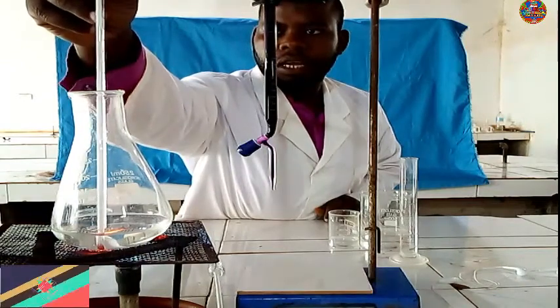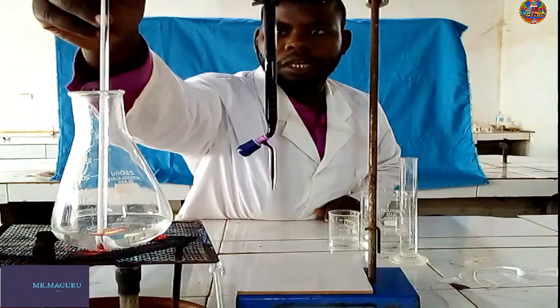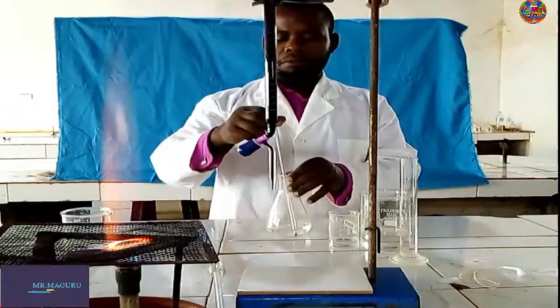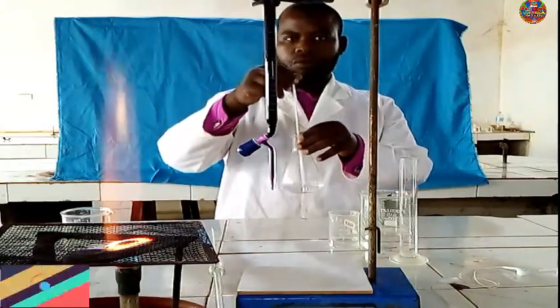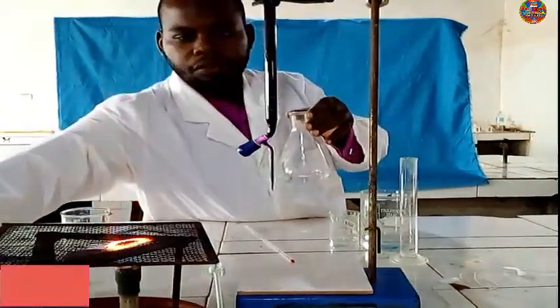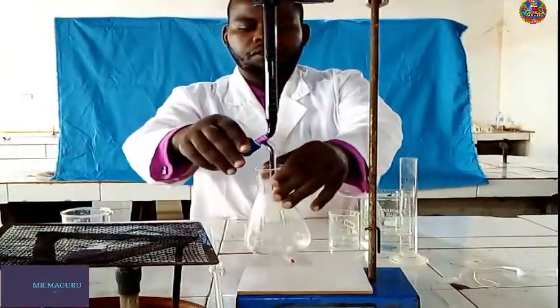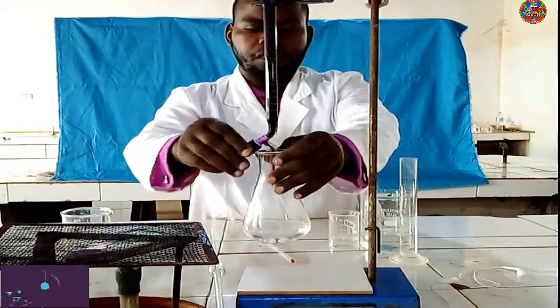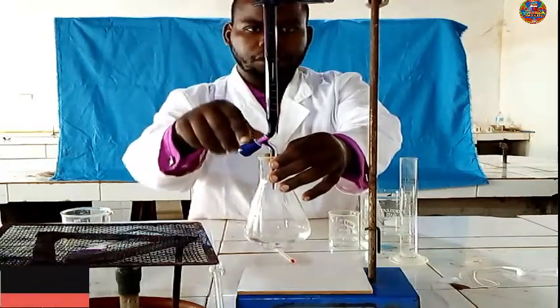Now we wait a minute to reach 70 degrees centigrade. That is now 0. If it goes above, you have to wait to cool your solution. And if it is ready, you switch off or minimize the gas of your burner. We note the initial volume, and then I will proceed with the titration. Let's be together at the conical flask to see the color change.